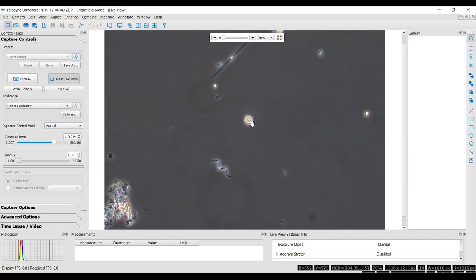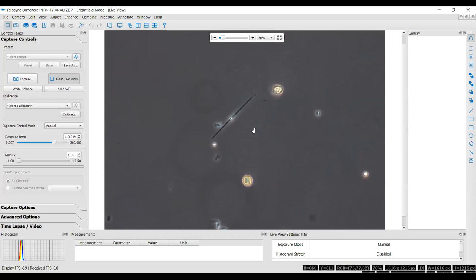This is Chlamydomonas with no flagella because it hates you. So it's pretty common for Chlamydomonas to drop its flagella on preservation. Yep. Just to spite you. And again, here's another Fragilaria, and I would call this filiformis, and those are 2 cells of a Pseudanabaena.